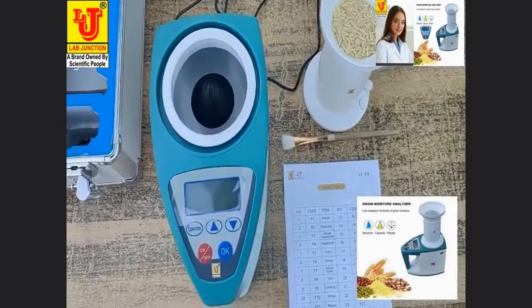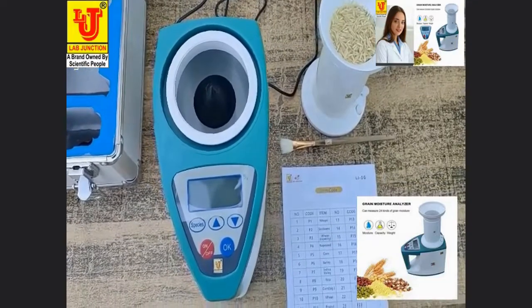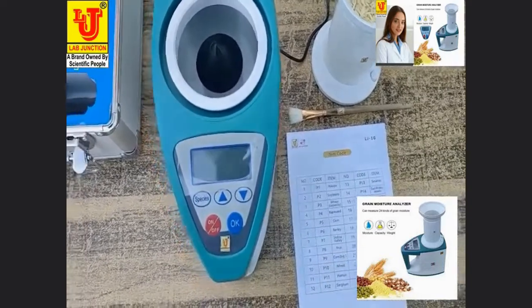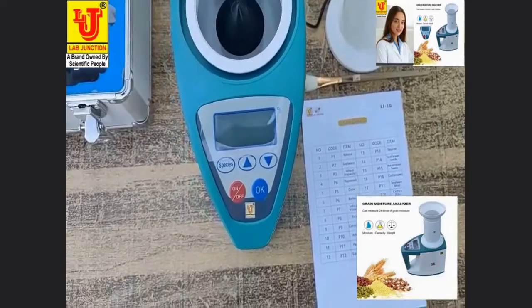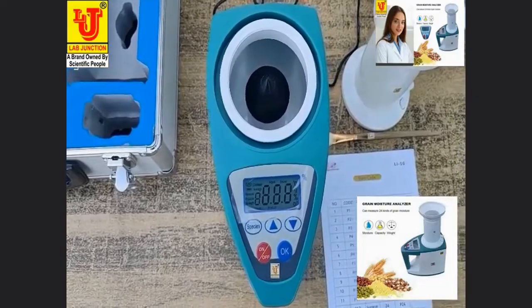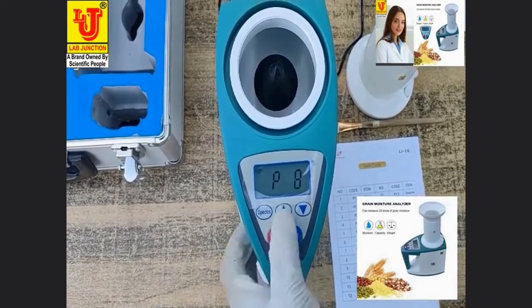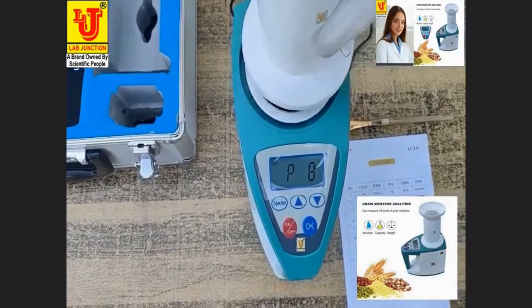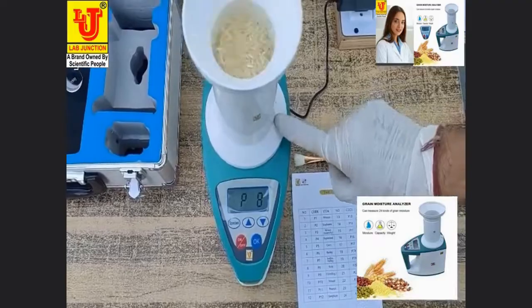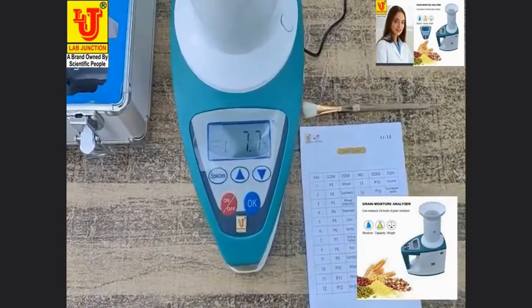Now I am measuring rice moisture. The rice moisture code is P8. Switch on the machine and press this key. Directly, rice moisture reads 7.7%.